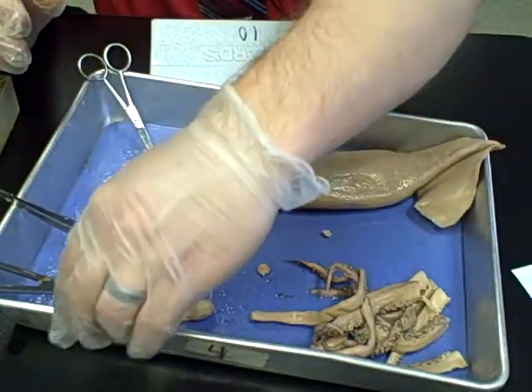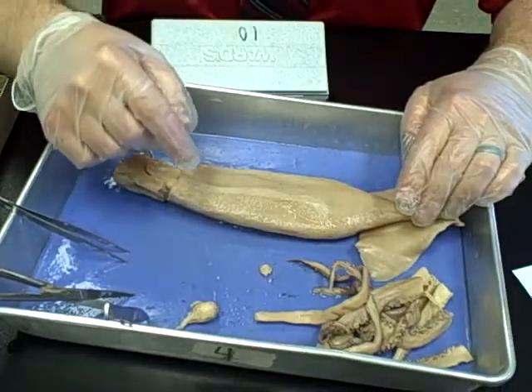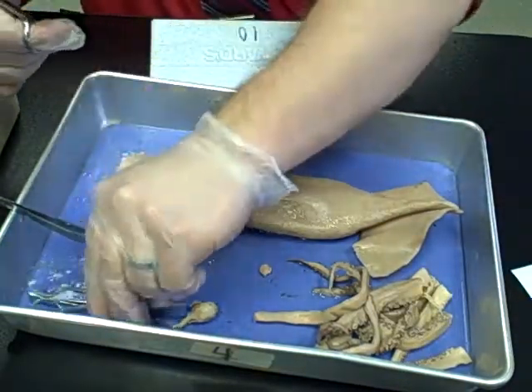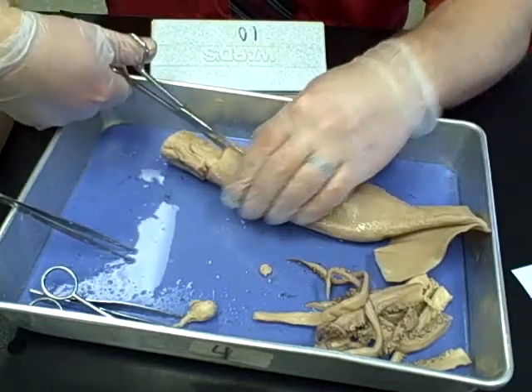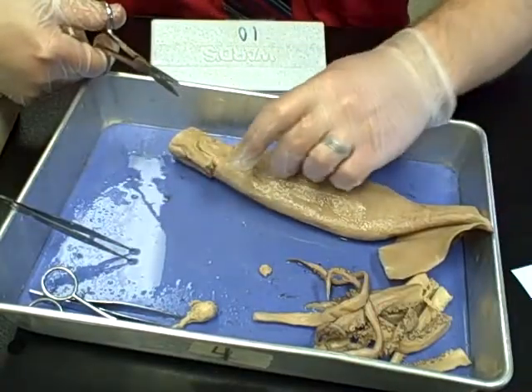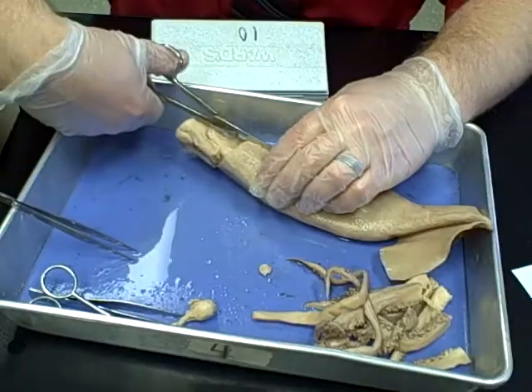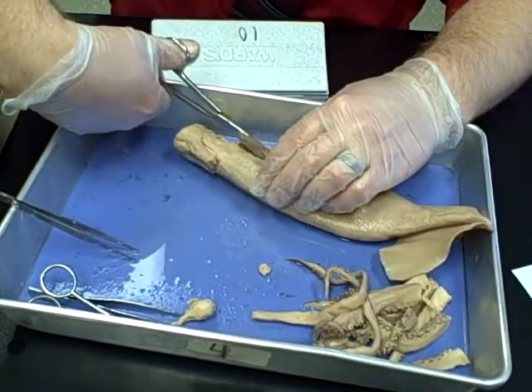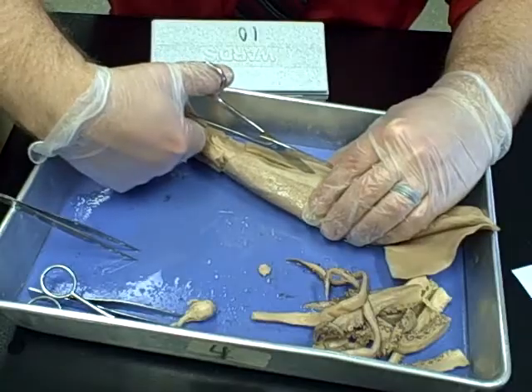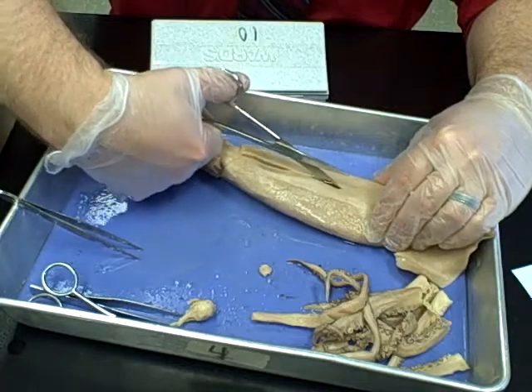The next thing to do is open up the mantle of the squid. Make sure the ventral side — the side with the siphon — is facing you. Take your large dissecting scissors and insert them right above the siphon on this side of the mantle. Pull up and away when you cut, because all the important organs are just on the other side of the structure. Make cuts as shallow as possible, pulling up on the mantle as you cut to make sure you're not hitting anything major.